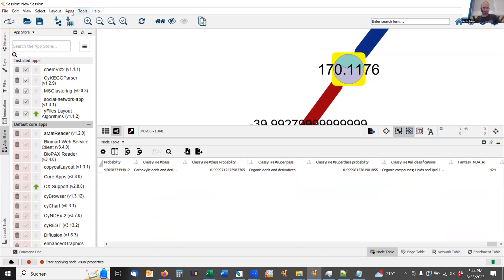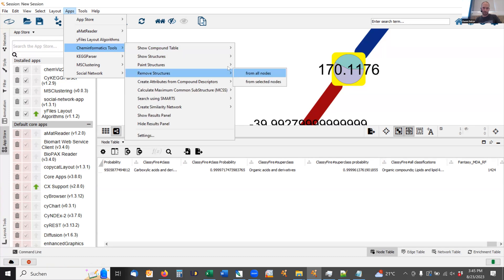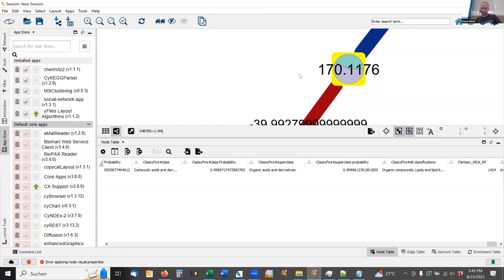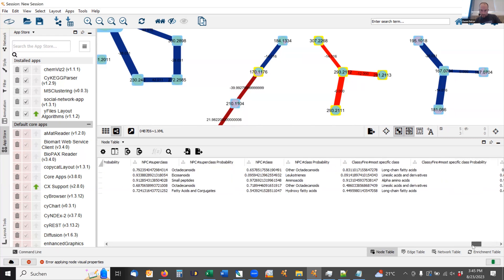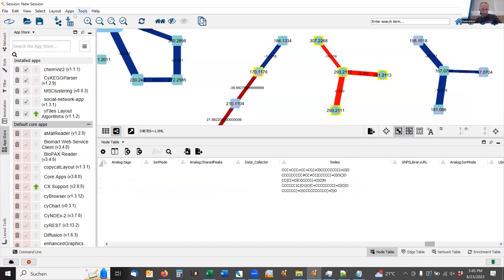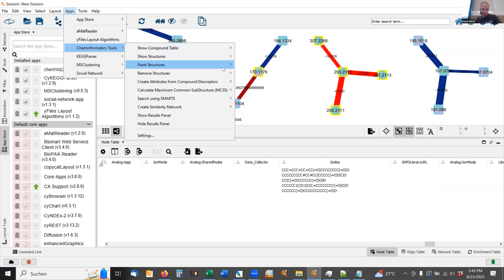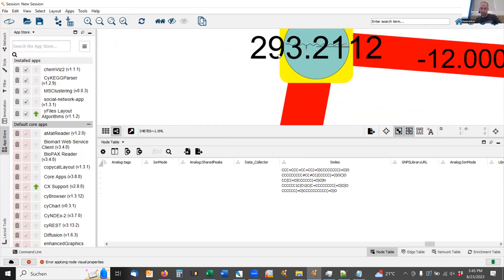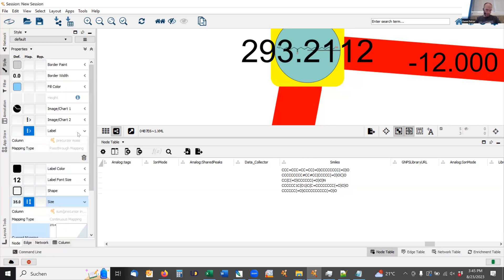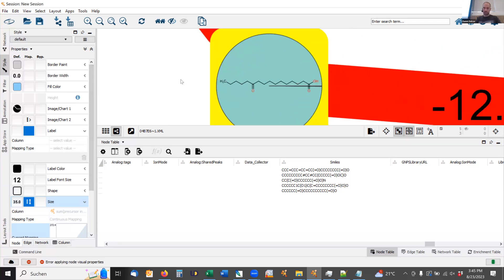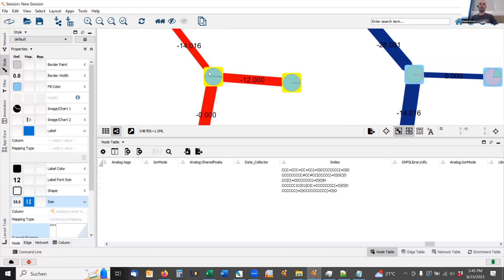Sometimes for larger networks it causes trouble, but we can try it for just one node. Now you can see it directly shows the structure. Obviously it's covered by the label, so if I go to Style and remove the label, you can now see the structure nicely. So again, there are tons of possibilities inside Cytoscape — feel free to explore and use them. And if you find out something exciting and new, feel free to email us and tell us, for example, how to add labels to pie charts — I still don't actually know how to do that.